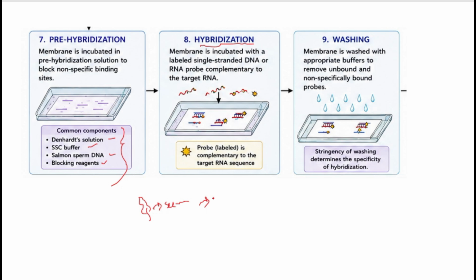So for that type of experiment we can use this. Or else, let us take the example of cancer cells. When there is cancer in a particular cell, some genes will be expressed, and if there is no cancer, the genes will not be expressed. So in this case, the northern hybridization technique, or northern blotting technique, is used.